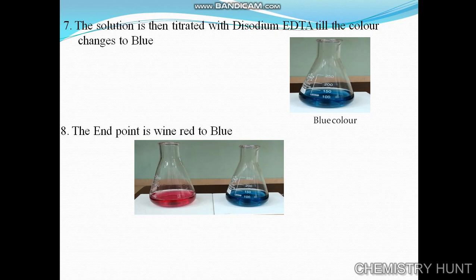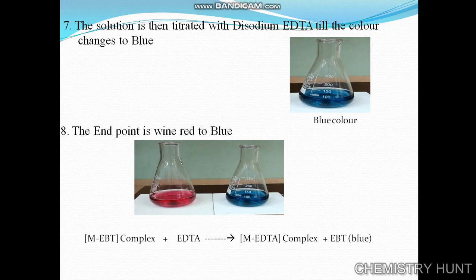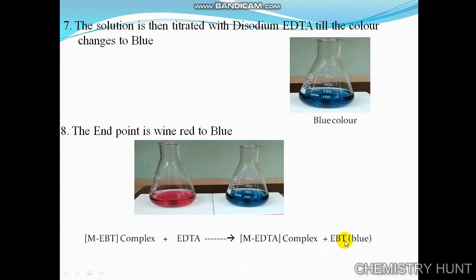First the solution is wine red, and then it becomes blue in color. The metal-EBT complex is titrated with disodium EDTA solution until all the metal ions — calcium and magnesium — form the stable metal-EDTA complex, releasing free EBT which is blue in color. The solution turns blue as all calcium and magnesium form the complex with metal-EDTA.